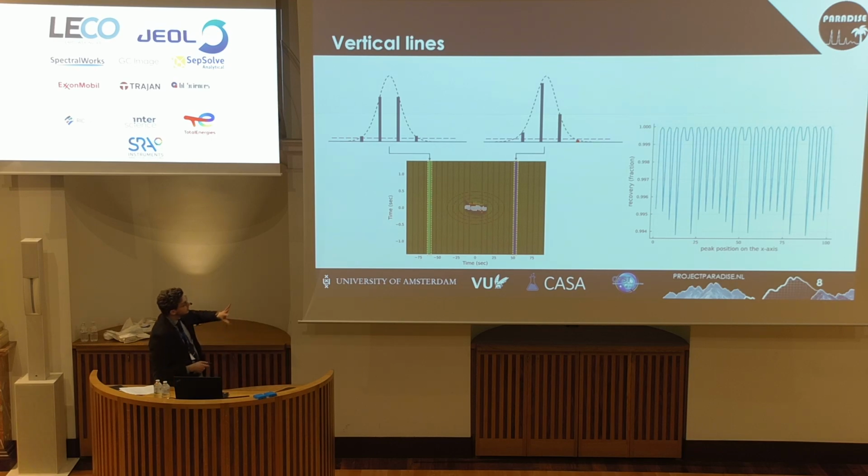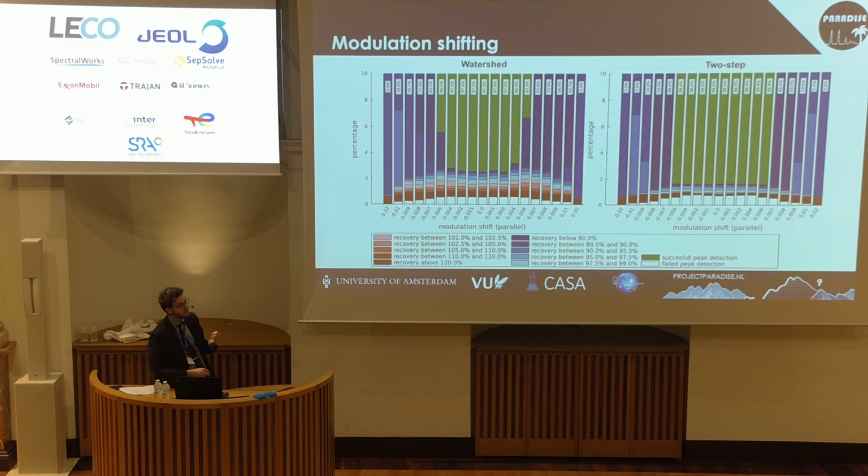Now, we can look at these plots as a heat map, and then we have location information. But in this study, because we simulated over 700,000 chromatograms and two peak detection methods, that would still be 140 of these figures. And you would probably all be very bored by the end. We opted to also have a different type of representation where we sacrifice a little bit of the spatial information and gain some insights into the trends.